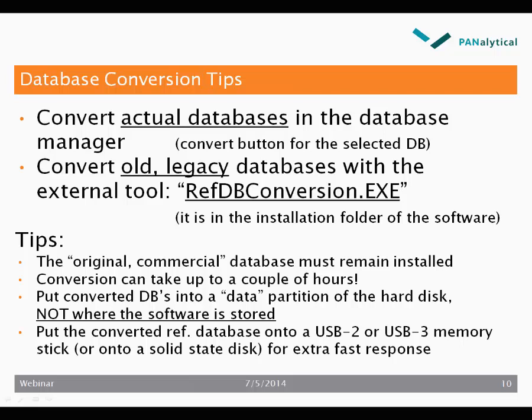Here are some more tips. The original commercial database must remain installed. Conversion can take up to a couple of hours. Put the converted database into a data partition of the hard disk, not where the software is stored. And put the converted reference database onto a USB 2 or 3 memory stick or onto a solid-state disk for extra fast response.